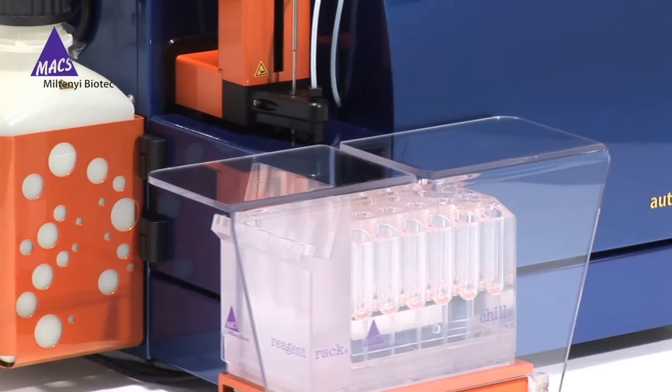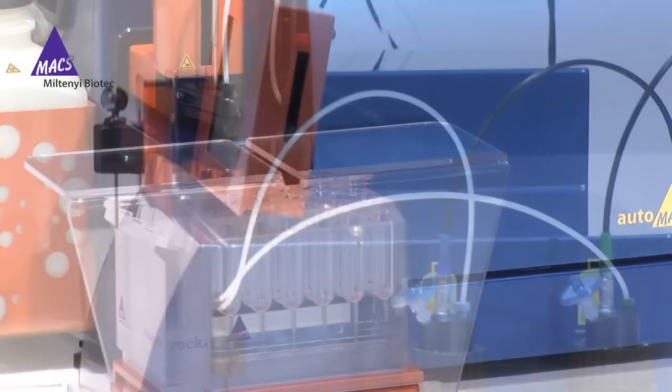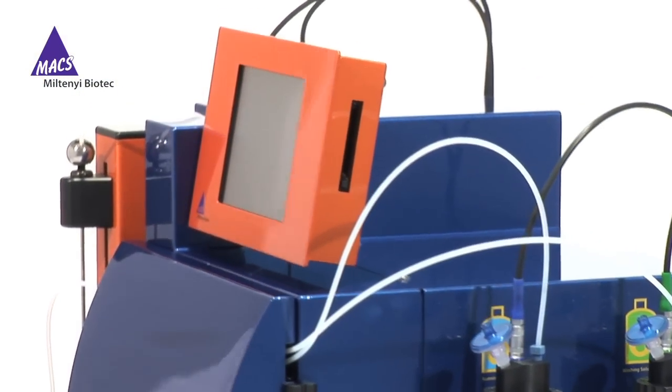Minimal handling is required, which is key for operator safety when handling contagious blood samples.